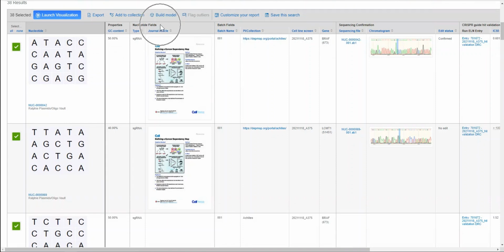In addition, you can set up as many configurable user-defined parent level and batch level fields describing these entities as you need. These fields can contain any type of data, from text and numbers to file attachments, links, and controlled vocabulary pick lists. In addition, you can implement certain business rules across these fields, making certain ones required for registration, or even enforcing unique checks for registration.